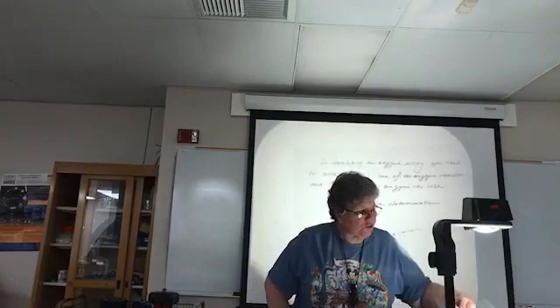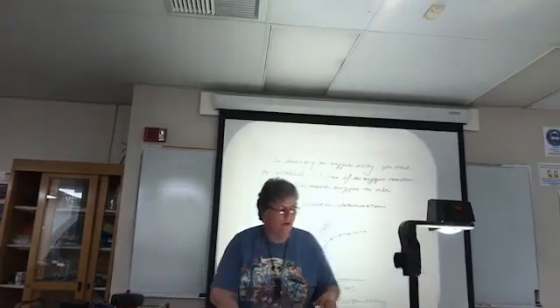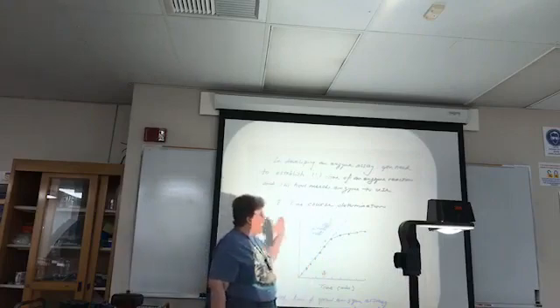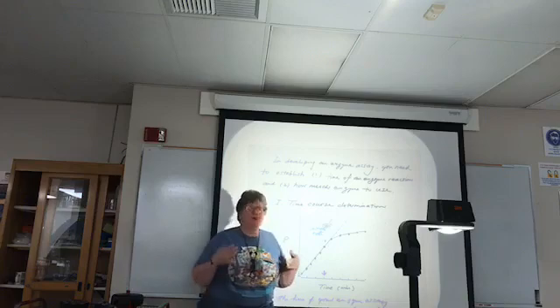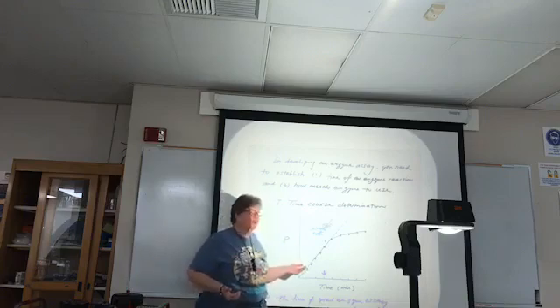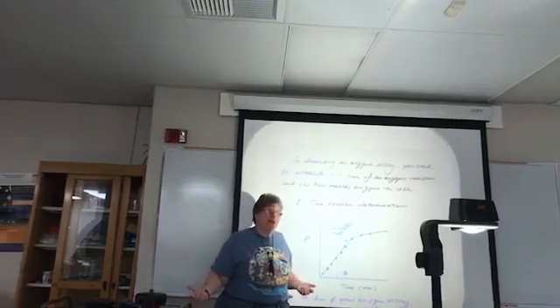So what you're going to be doing in this enzyme assay. The first thing you need to do is say, well, how much time do we need for our enzyme assay to take place? Some enzymatic reactions happen very quickly. Some enzymatic reactions happen very slowly.